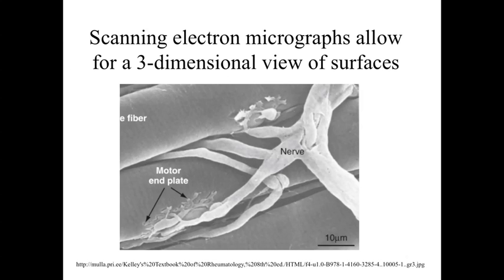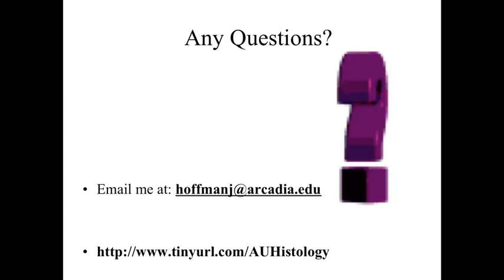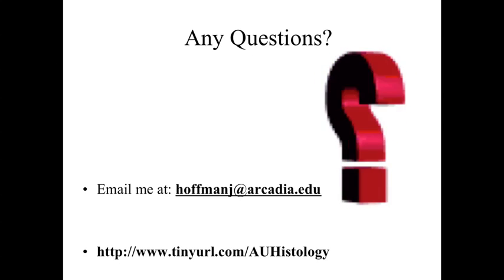But with this set of slides, we've looked at various ways in which we can look at and learn about the connection between a nerve and a muscle cell and better understand what is going on, better understand what the proteins are doing, better understand what that mechanism is, that relationship between anatomy and physiology by using these different tools. That's the end of the Introduction to Microscopy lecture.